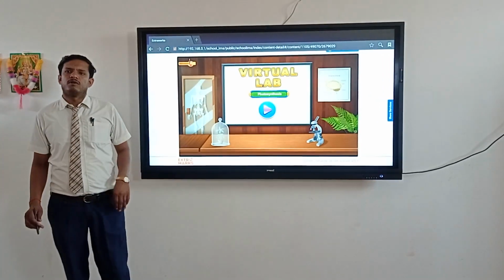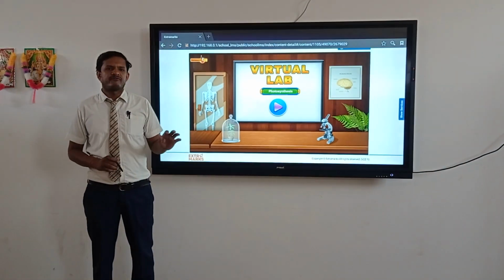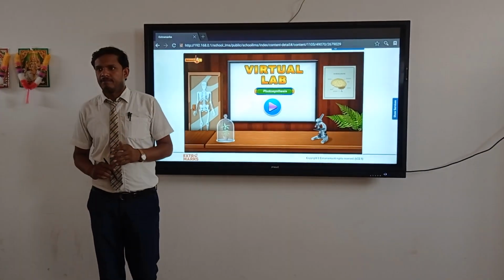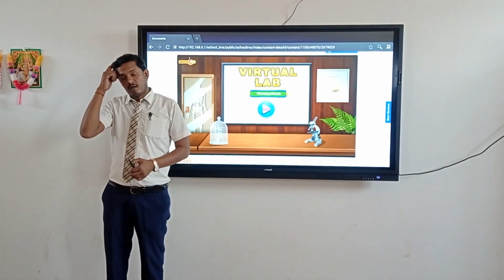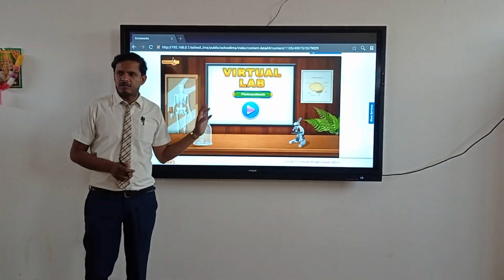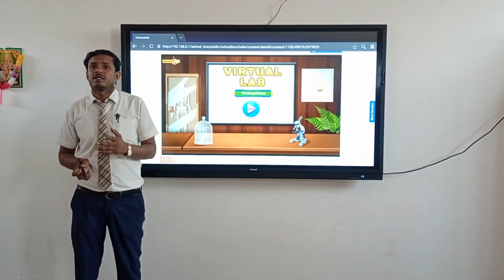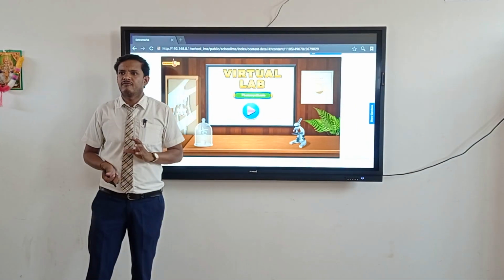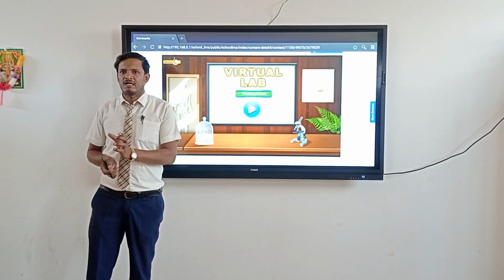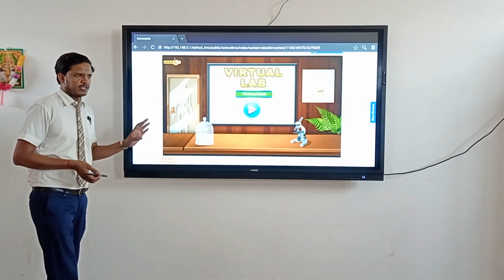We are going to perform a virtual lab on the topic photosynthesis. After completing the topic here, we will go for the wet lab, where we are going to perform the experiment by ourselves. Here you are going to have the basic concept, how you have to handle the instrument, how to follow the procedure, what precautions you need to take care of while performing the experiment on photosynthesis, and what criteria you need to focus on. All these things we are going to discuss here today.